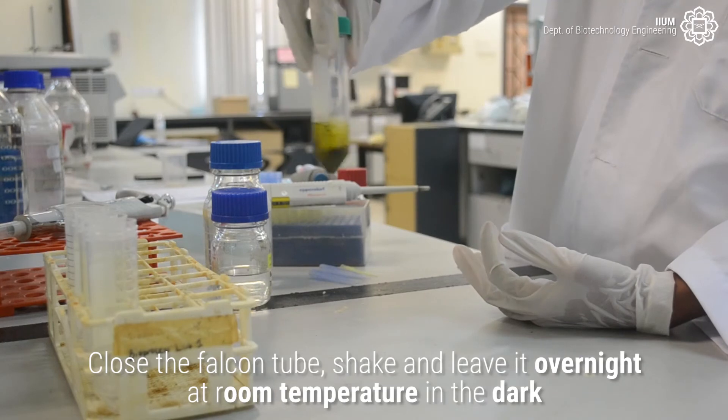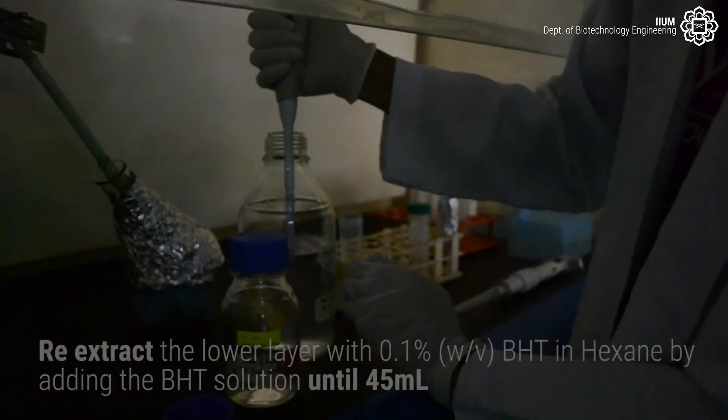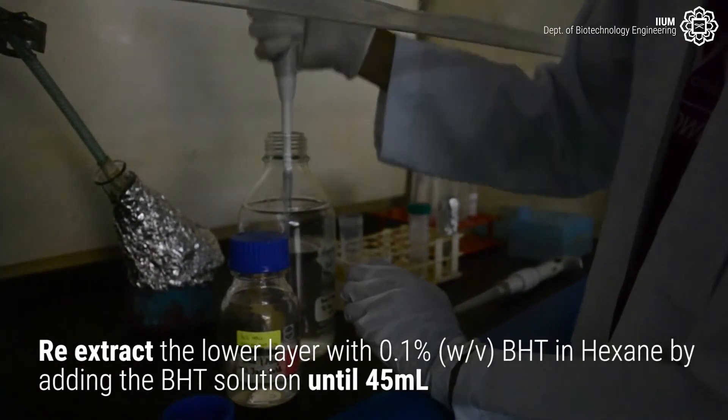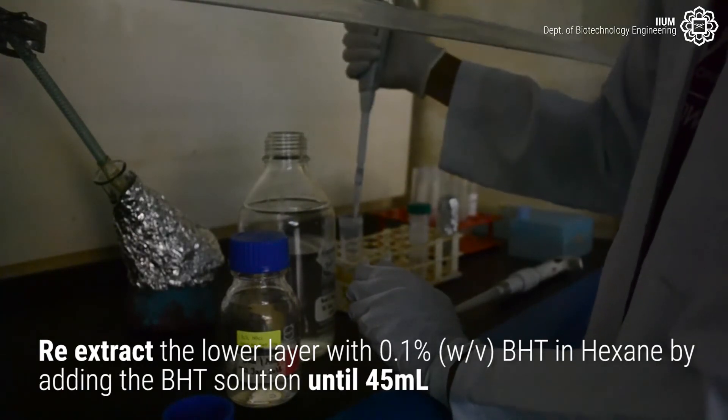Shake and leave it overnight at room temperature in the dark. Please note that the next steps of saponification must be conducted in the dark.